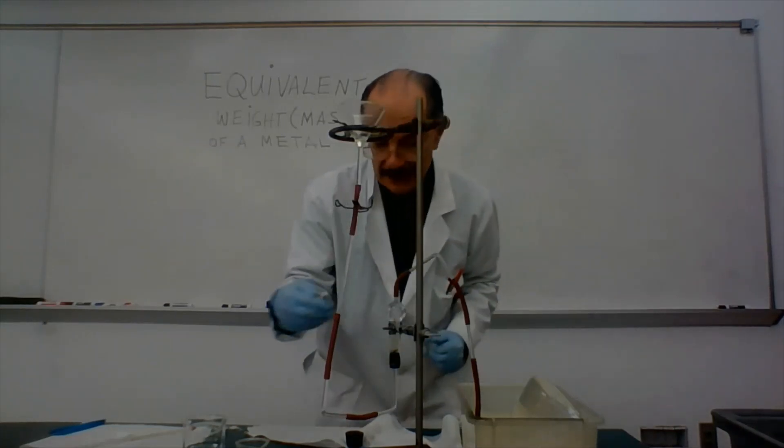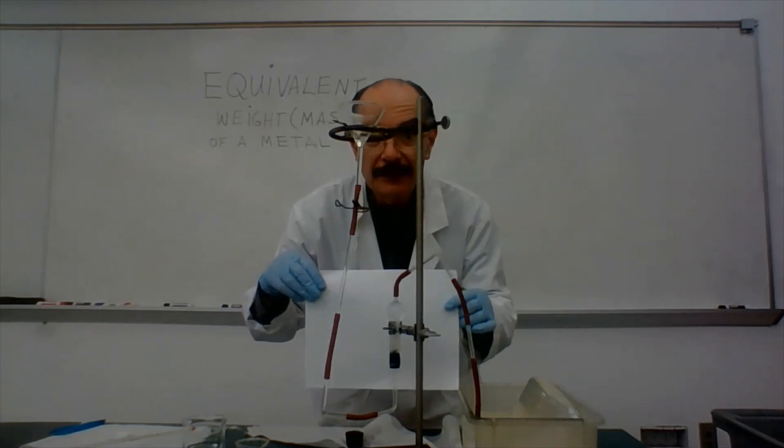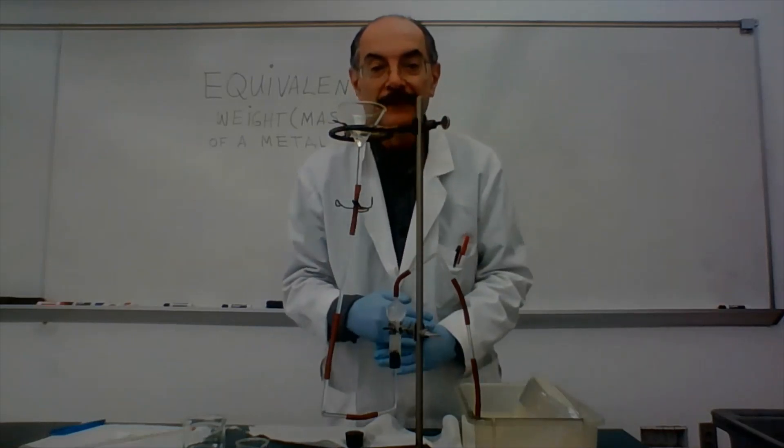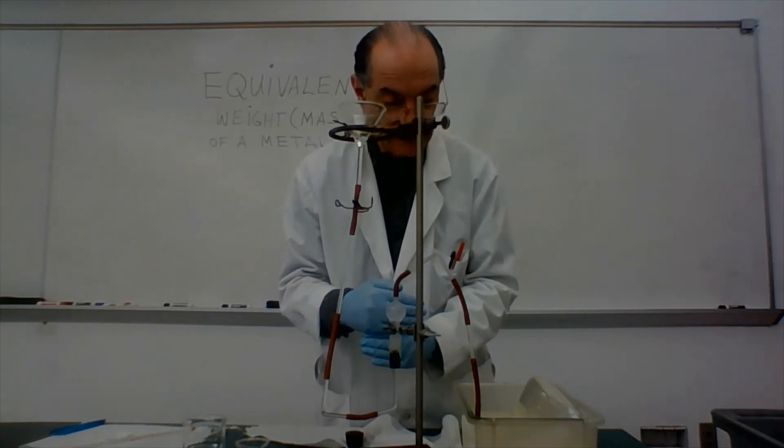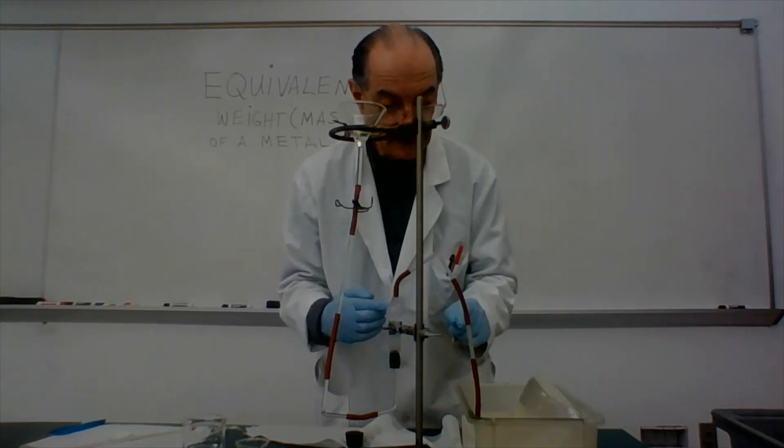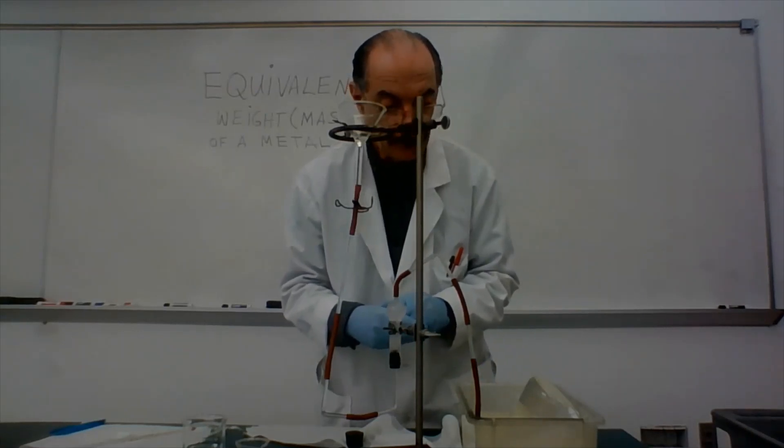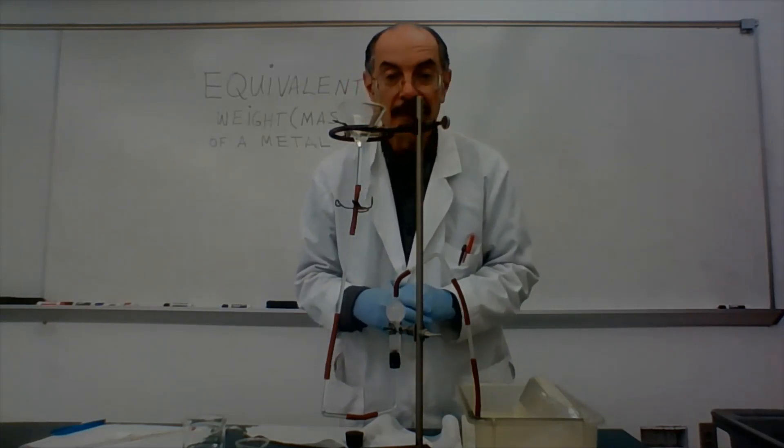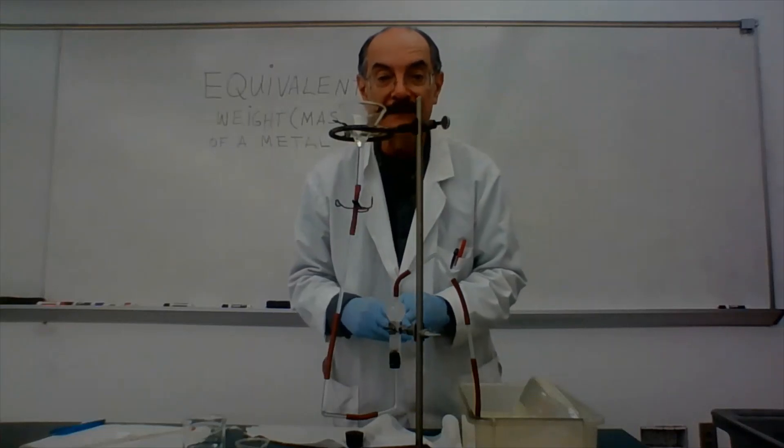And as it goes down, it's going to start moving down and it's going to start reacting with the metal. And you'll see the metal start forming bubbles. Let me see if I have something here that will allow you to see this, but it is foaming ferociously here. Right there in front of my hands. And as it does, it starts producing hydrogen gas that is going to start migrating up this tube and it's going to start bubbling into the water inside the flask. So I'm going to let it run a little bit here. And while we do that, we will take a little pause in the video here and I'll be back as soon as this is finished reacting.